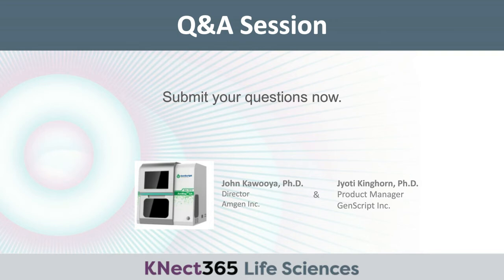Is that towards me or to Jyoti? I think, John, you can answer that. Okay, so I can go ahead. So the question is about what? Sorry, if you can repeat the question. Sure. Is it correct to say MagBeads are more suited for screening stage of protein purification?